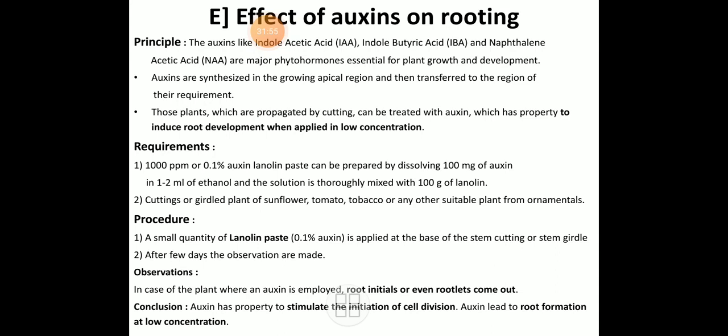In that, some growth hormones are there. And those growth hormones induce or accelerate the root formation. So which type of effect takes place, that we have to study under this demo experiment.